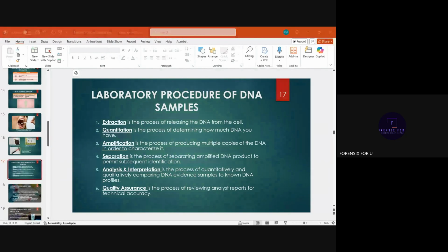So what is the location of each marker out of these 26 markers? What is the length of the marker? What is the exact allele and the location where these markers are present in that particular individual? Those are interpreted after separation and extraction, and ultimately the DNA quality is checked. The report is reviewed, and we estimate whether the quality of the DNA that has been obtained is good enough to report or not. Clear? Yes.